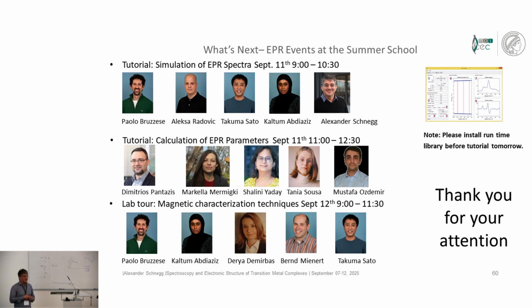The school is still not over. We are on Wednesday, and there will be more about EPR tomorrow and also on Friday. We do a tutorial tomorrow on the simulation of EPR spectra. I will repeat a few things, and if you have questions you would like to try out, we uploaded a program for the simulation of EPR spectra.